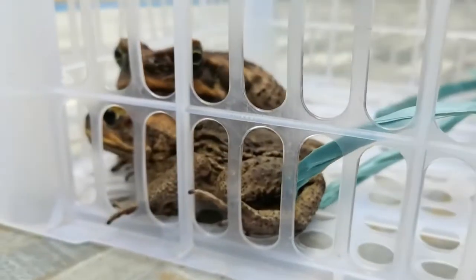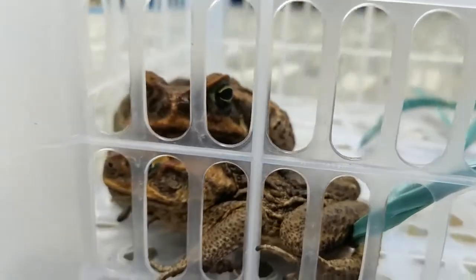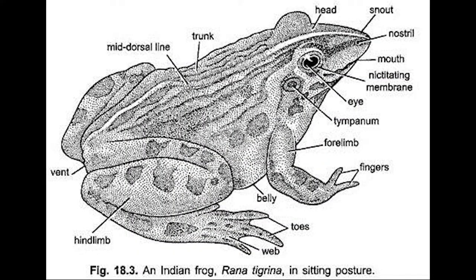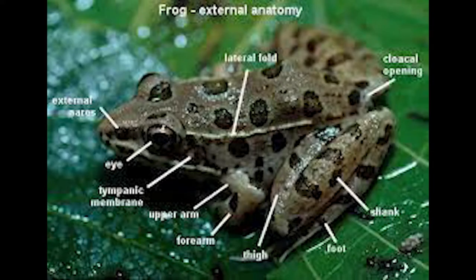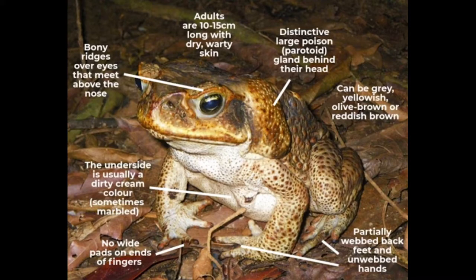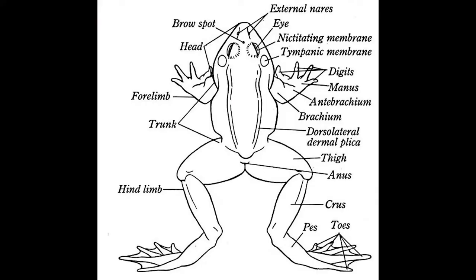By studying the anatomy of the frog, you will be able to better understand your own body. In this investigation, you will examine the external features of a frog and identify parts of its external anatomy. In addition, you will dissect the frog to observe its internal anatomy.